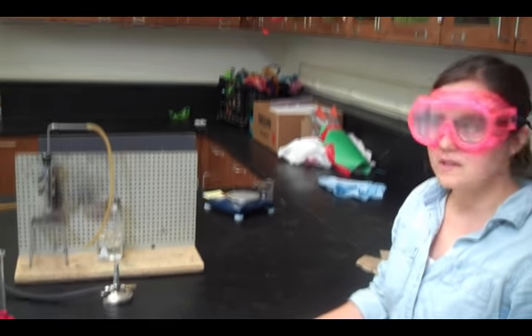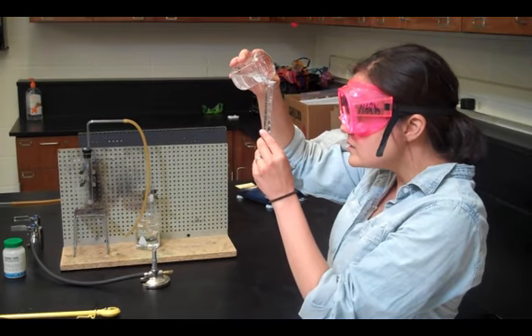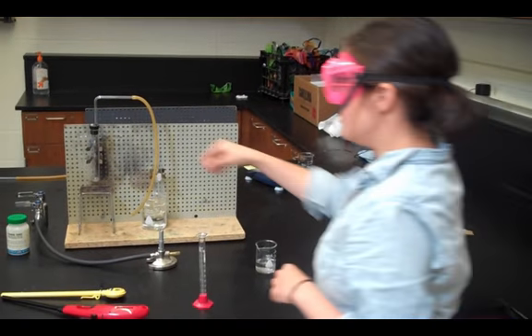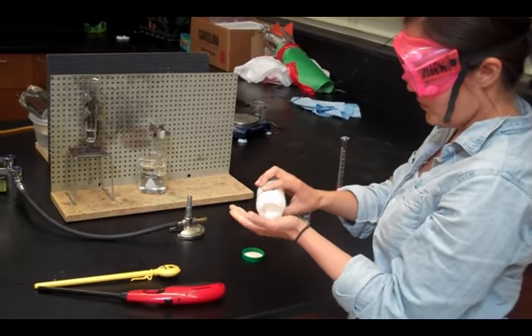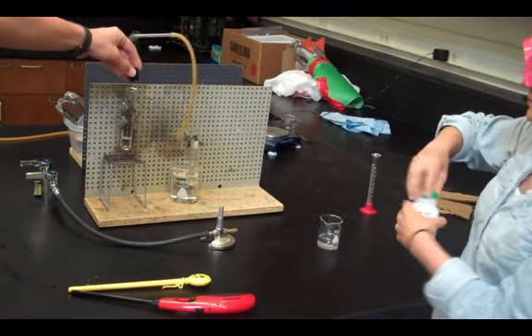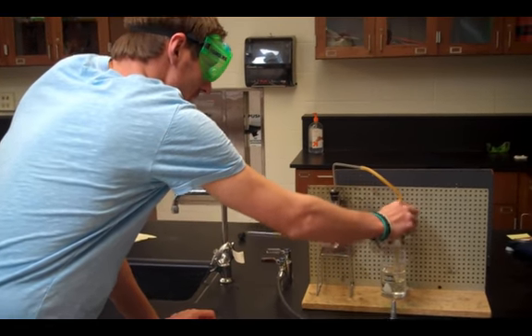So our first step is going to be to measure out the assigned volume of liquid that our teacher told us. So measure out, that looks about right. I'm going to double check. Okay, and then I'll pour that into this test tube, along with 2 or 3 boiling chips. Once you have your boiling chips in there, you can put your rubber tubing in your large test tube.